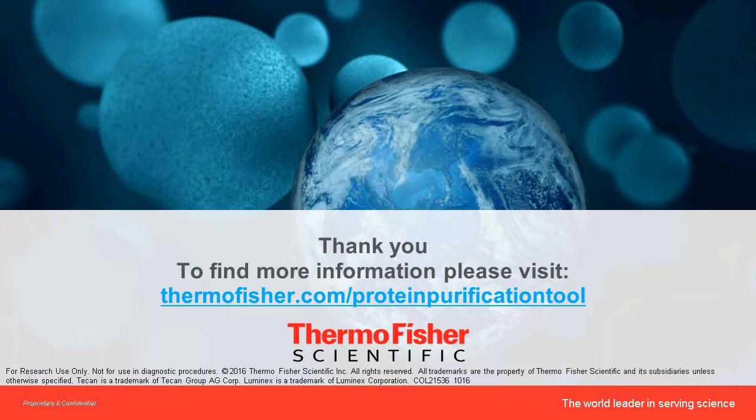Excellent. Thanks, Bhavin. And our next question asks, is it possible to get peptides in the enriched IP-MS which are not present or in extremely low abundance in the input total protein fraction? Would you trust such peptides? And if you were, how would you calculate the fold enrichment for such peptides? Is that something you can help out with, Bhavin?